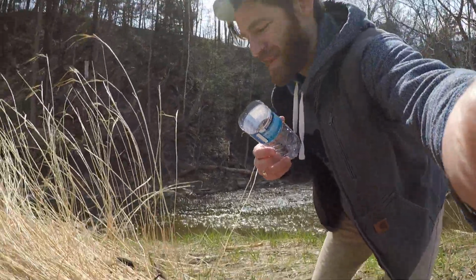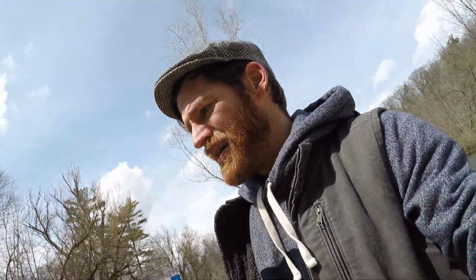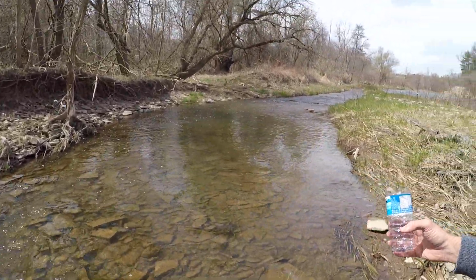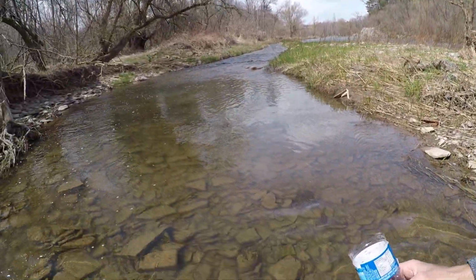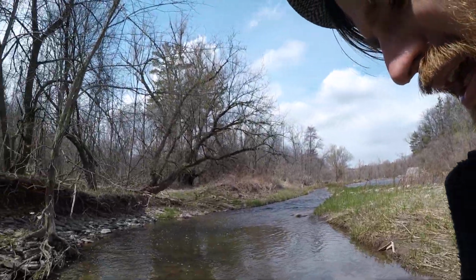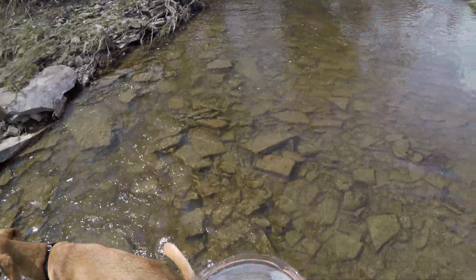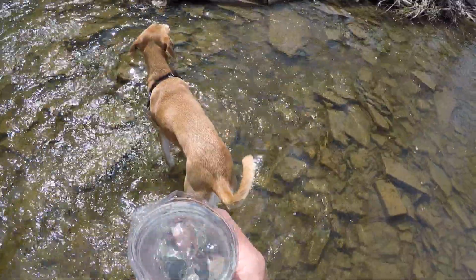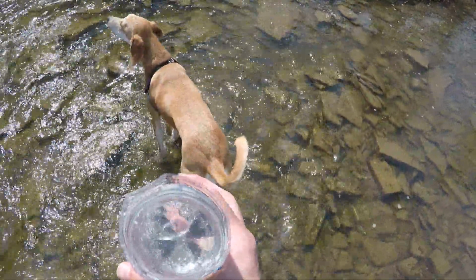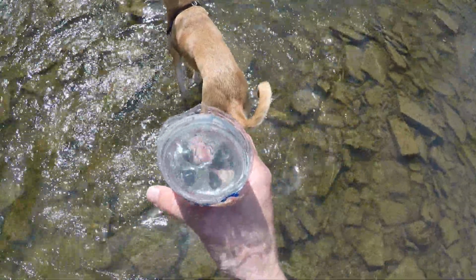Cool? Okay, let's go to the stream and we'll take a look first at this little tiny trib that's moving rather quickly. And let's get out here and we'll go ahead and take the whole thing full. And I can look down and you can see there are dark spots at the bottom of this cup.